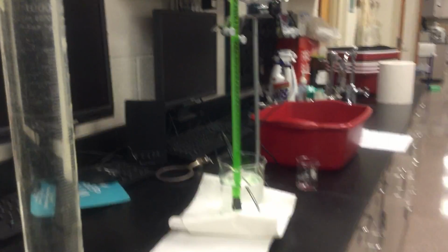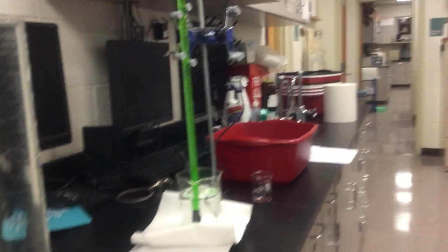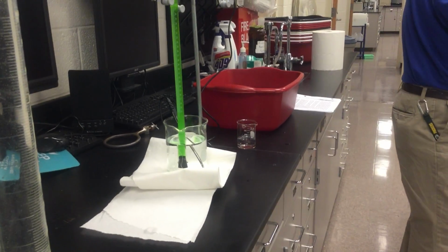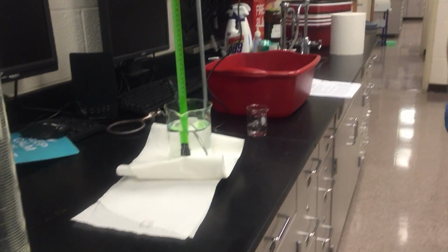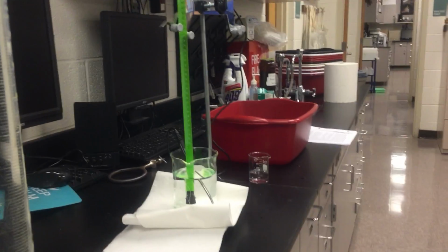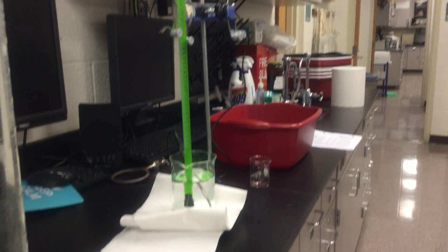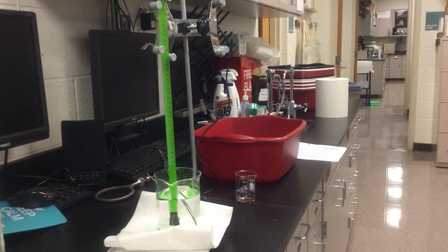Okay? Now, obviously, if I go to Denver, Colorado, it's a little higher elevation than where we are, correct? Okay? So that pressure is going to be a little bit different, but they convert it back to sea level so it's comparable to us, so we can do the comparisons. So we're going to have to take our reading and convert it to our elevation. And just off the top of my head, I think it's something like 892 feet above sea level that we are here in Seatown. Okay?